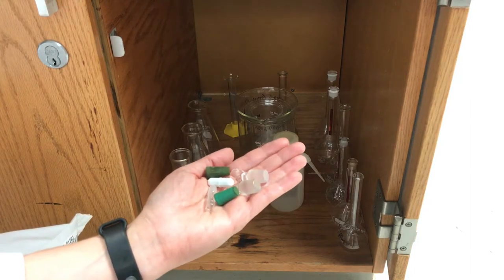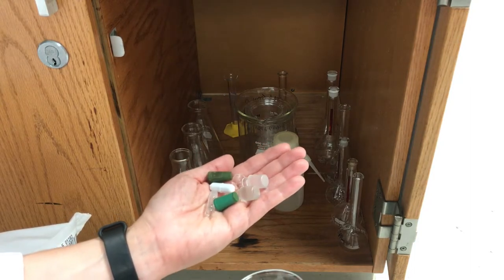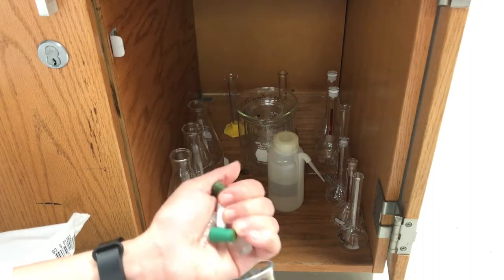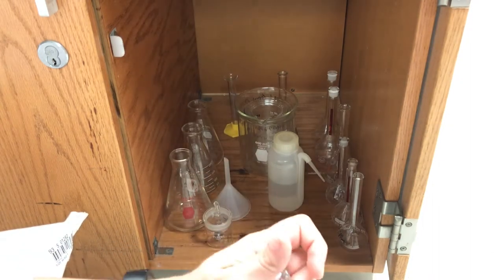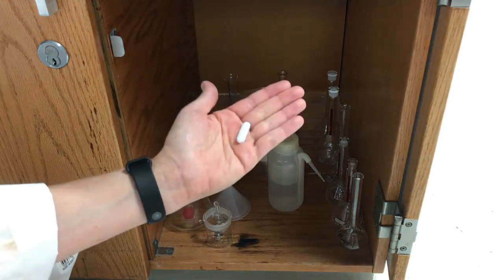I want you to make sure that these will fit with your flasks and if not we're going to replace them with ones that do. You'll also have a magnetic stir bar.